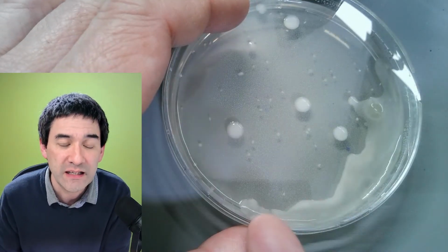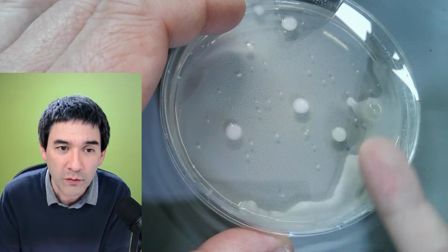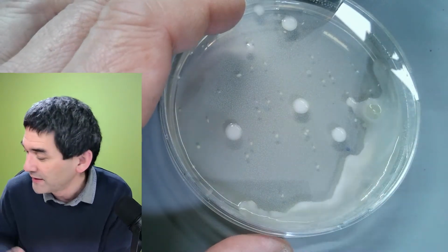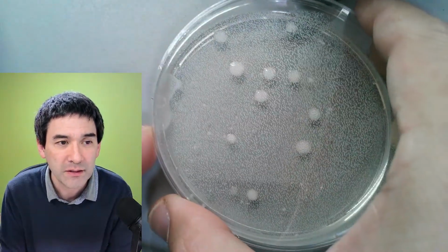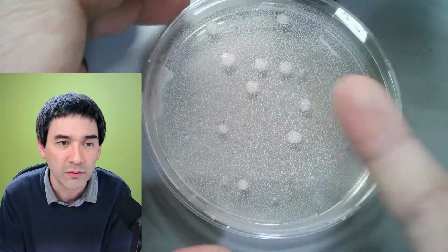Right? And again, here on the side, that is because there were some water droplets running over it because I messed up the medium, right? And it kind of spread the bacteria as well. So that's why these are very bad cases. But at least, yeah, I have now some bacteria. There's also some water condensed here.